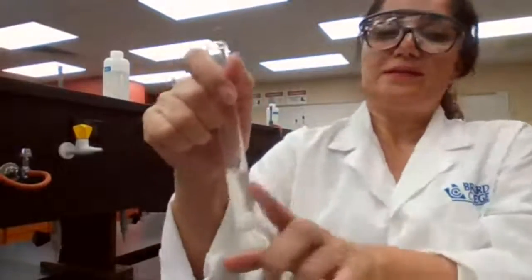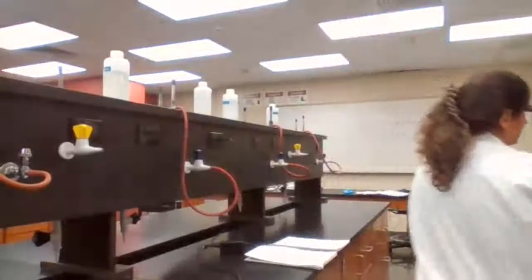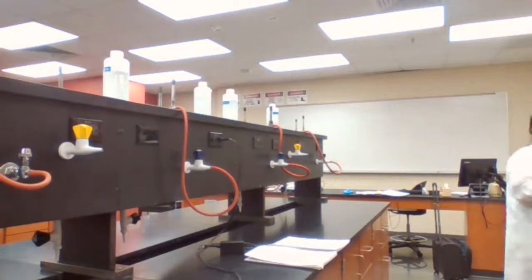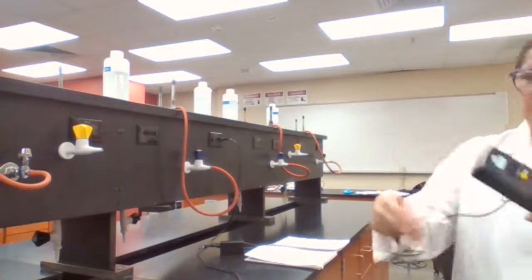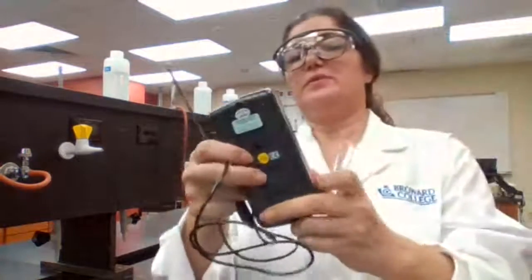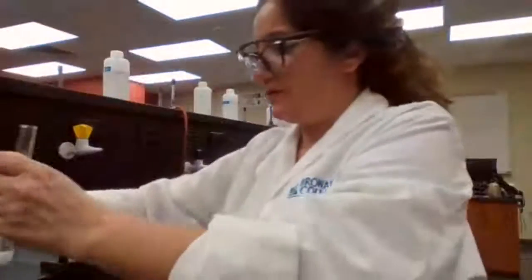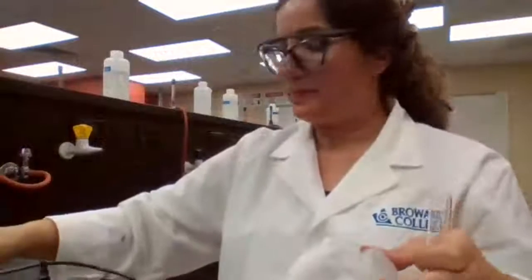Use the thermometer to test for temperature. Since you're not here to test the temperature, I'm just going to give you the difference in temperature.